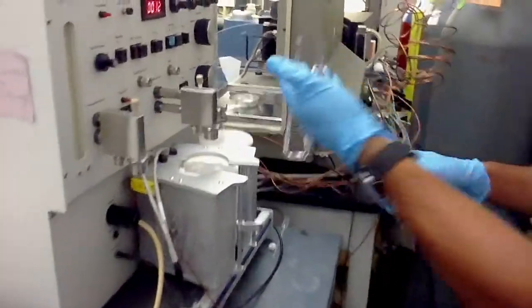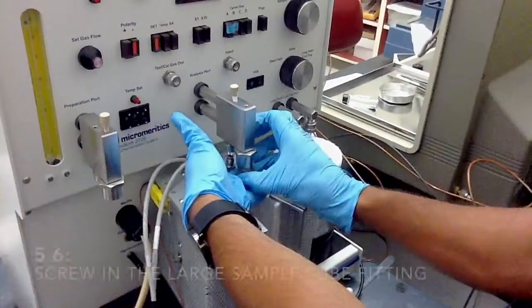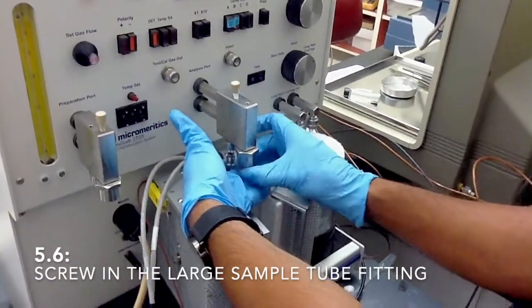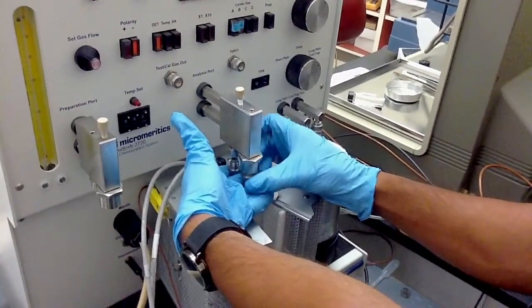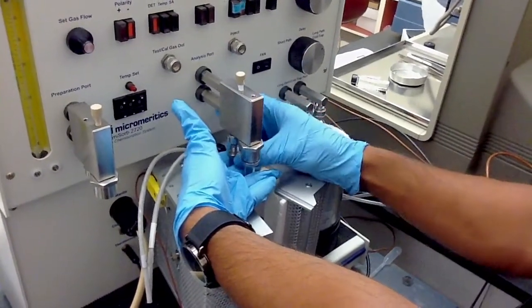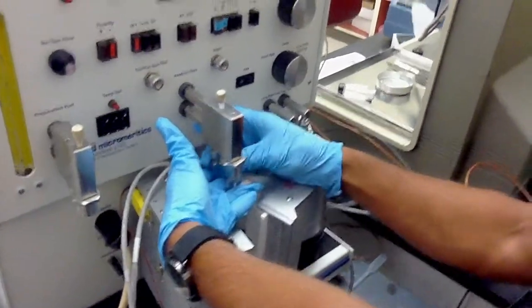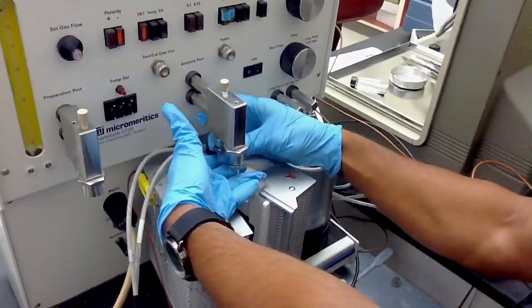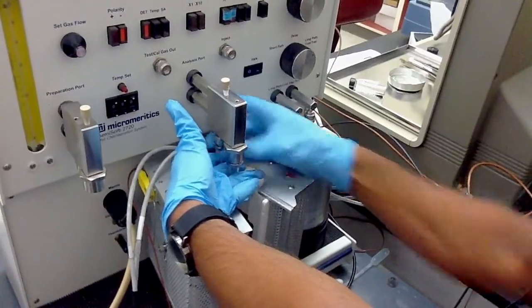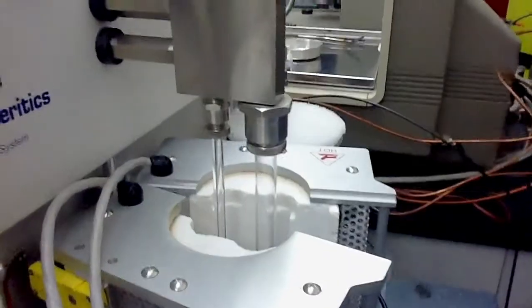And then take it out here, the same way, and lock it using just a two-finger tightness. If you place it right, you don't have to fight with it. If you do have to fight with the setting, that means something is wrong here. You can see it's nice and tight, nicely fit here.